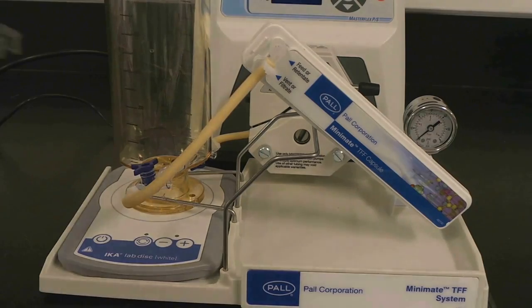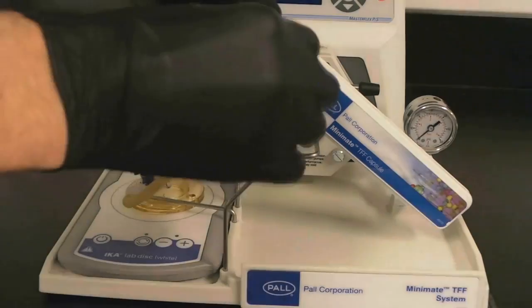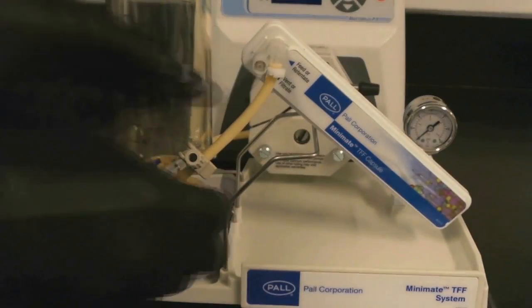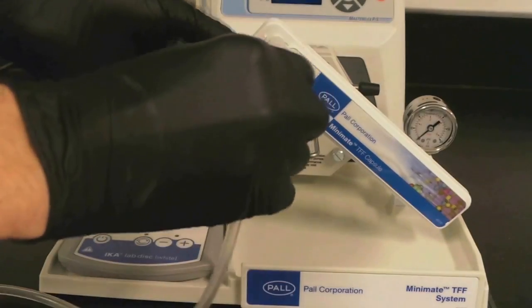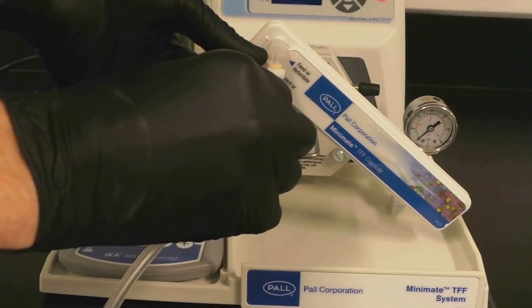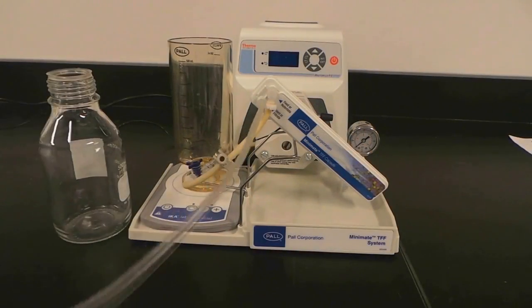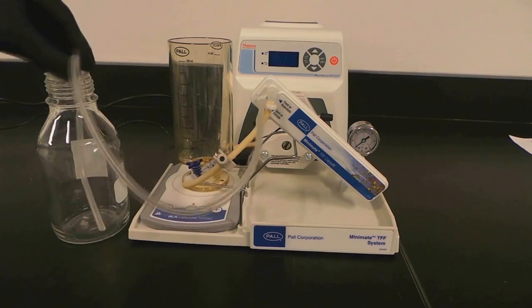And place a clamp onto the retentate tubing, but don't fully close. Complete the initial tubing installation by attaching the long, clear tubing to the filtrate port. And finally, place the tubing into a flask, and your Minimate system is now ready to run.